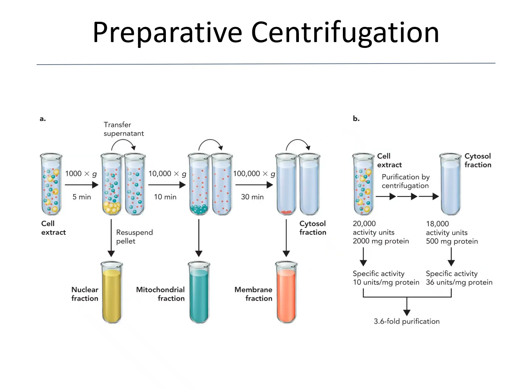And this slide shows the preparative centrifugation. Basically, preparative centrifugation can be used as an initial step in the protein purification. So on the left side here, A, from the beginning cell extract, based on the differential centrifugation method, increasing the G force from the first step at 1,000, then 10,000, 100,000 G, with different centrifugation speed and runtime, it is possible to obtain at least 4 subcellular fractions, and then each of these fractions can be analyzed for the target protein using a biochemical assay.